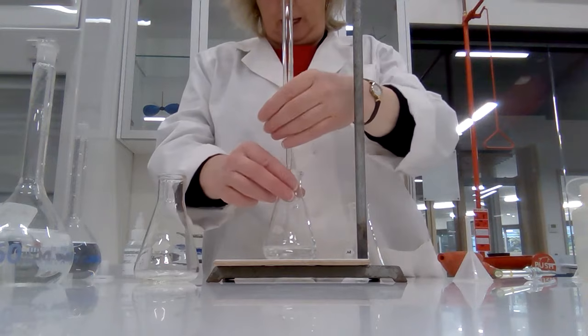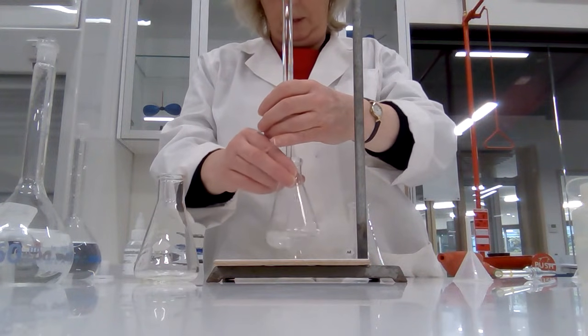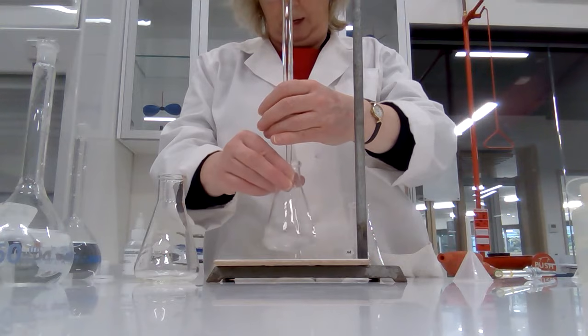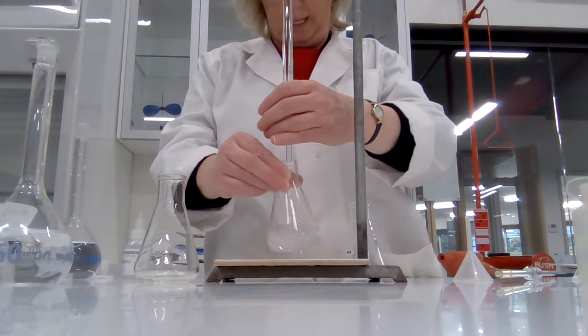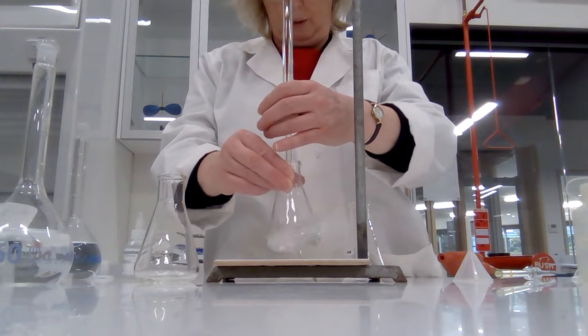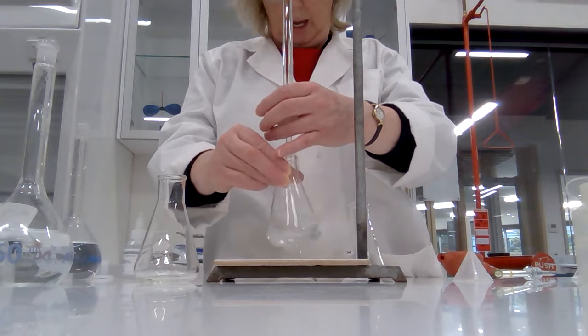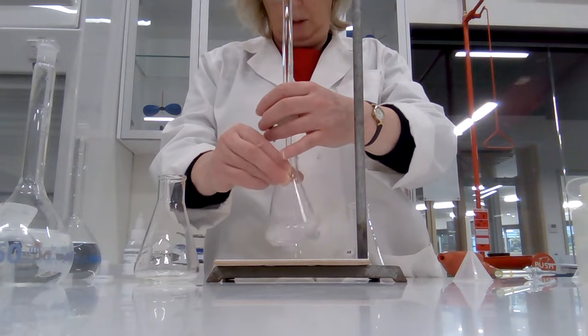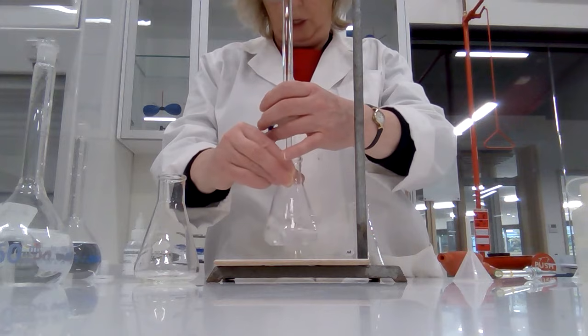Okay, let's see how we go. Take the funnel out and let's see what happens. So we're expecting the pink color of the phenolphthalein when it's basic, when we've got an excess of base. Looks like it's not going to be long. We're already getting a pink color in the flask. That's excellent. Everybody likes a quick titration.